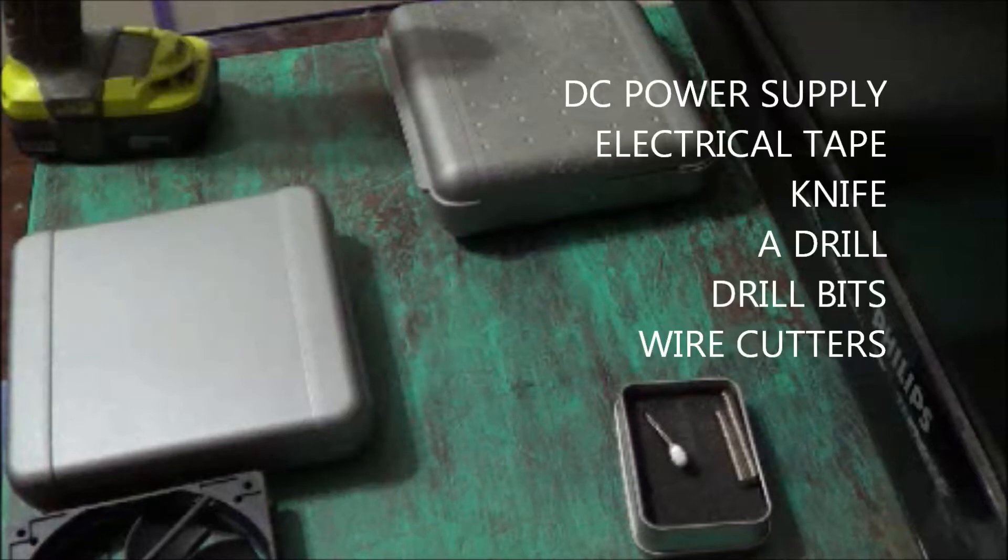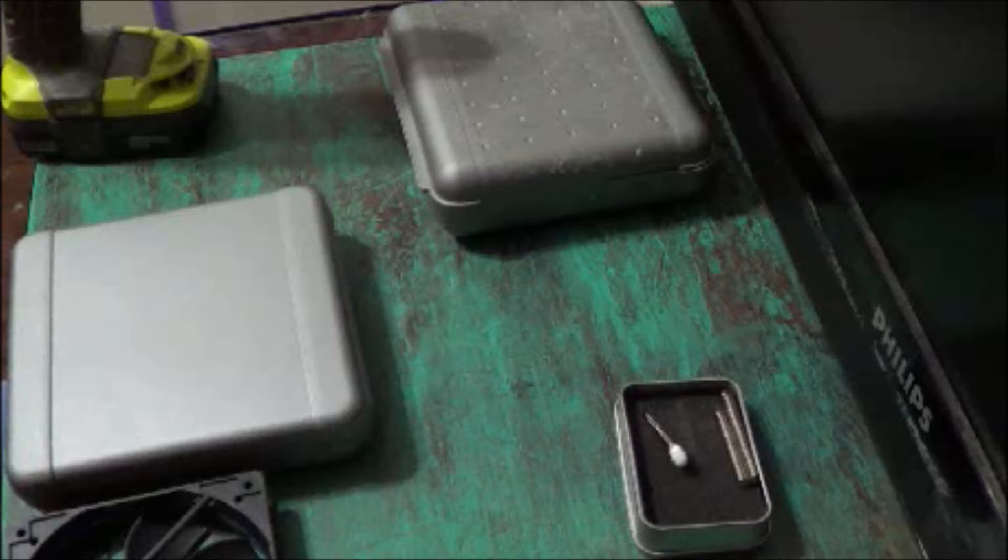Also you will need a DC power supply, electrical tape, a knife, a drill, some drill bits, and wire cutters.